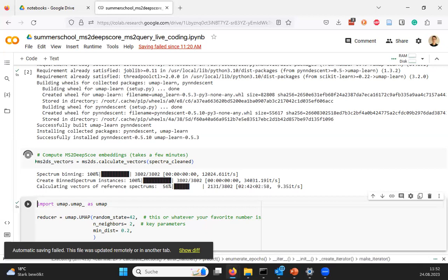Maybe now that we have time, I should also mention another thing. We trained this network that we're using here with GNPS. So what it can do well, I assumed at least, is predict chemical similarities between compounds that are often found in GNPS. But the more exotic the compounds get, the more rare they are or the more different they are to the standard of what you see in GNPS, the less I would trust these predictions. But I guess that's a problem with all data-driven tools, that you rely on the data that you can train on.